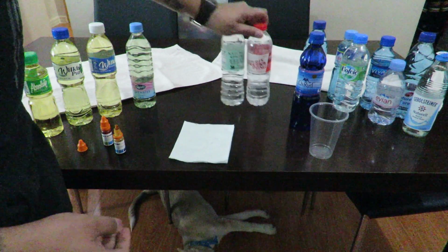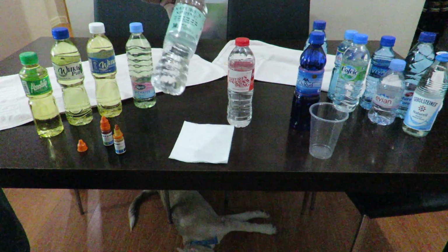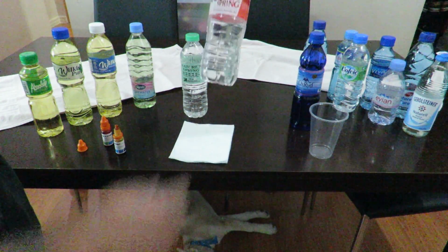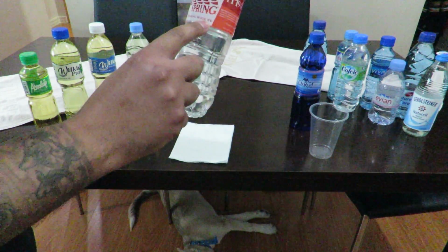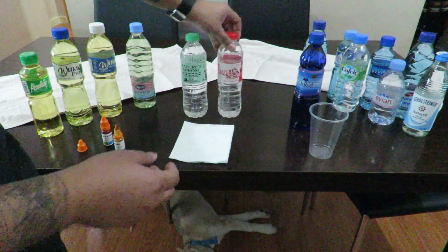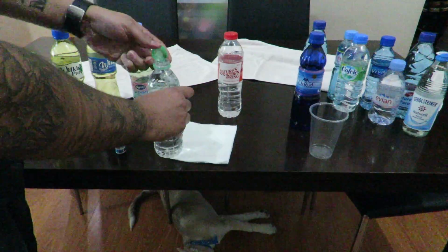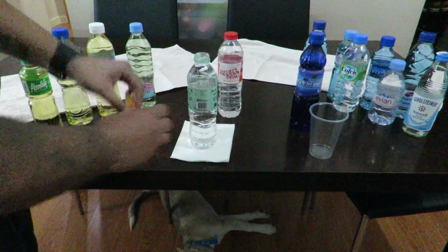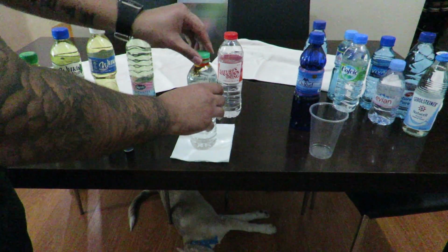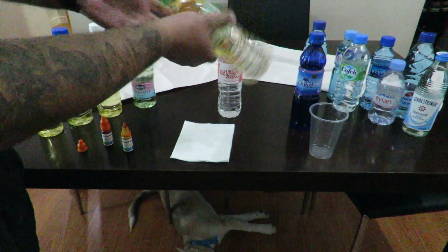And our next one is Nature Springs. Now Nature Springs comes in two different brands that I found in the store. The first one is distilled drinking water, and the second one is distilled drinking water, but it tells you that it'll give you a pH of 9. A pH level of 9, the red label. So we will test the ordinary one first. Let's just put a lot of our pH tester in it so we get a good color. Top on, give it a good shake.